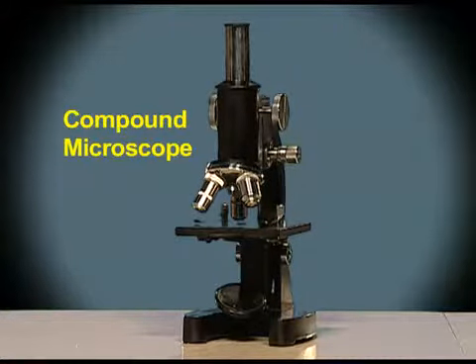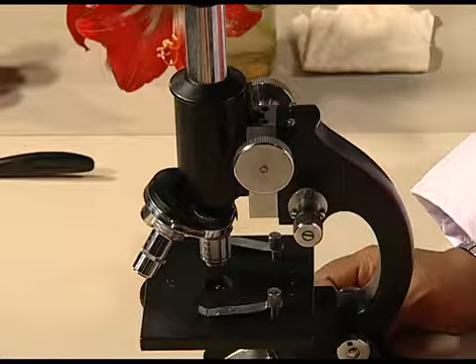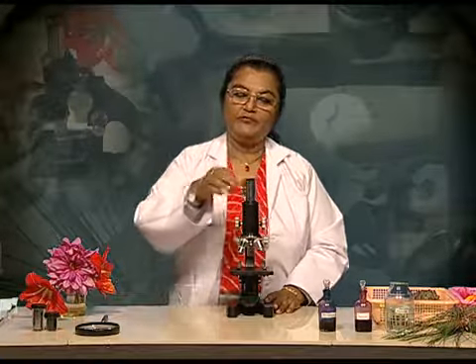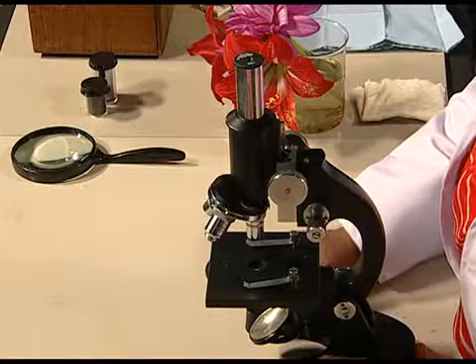The third type of microscope that we will look into is the compound microscope. A compound microscope has a combination of simple lenses which offer a much higher magnification of the object. Let us see now the parts of a compound microscope, which is also called compound light microscope. We will begin looking at the parts of a compound microscope from top till bottom.